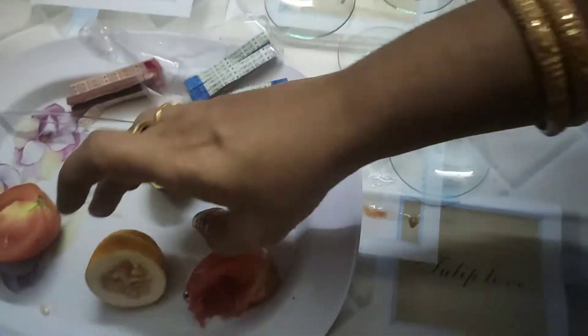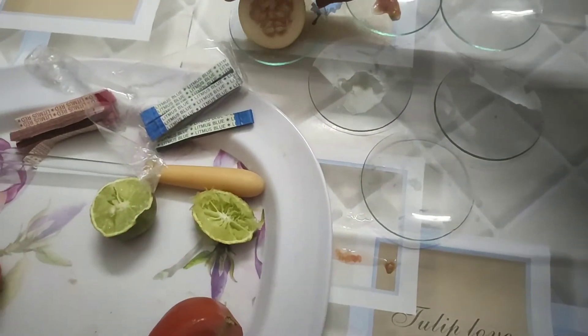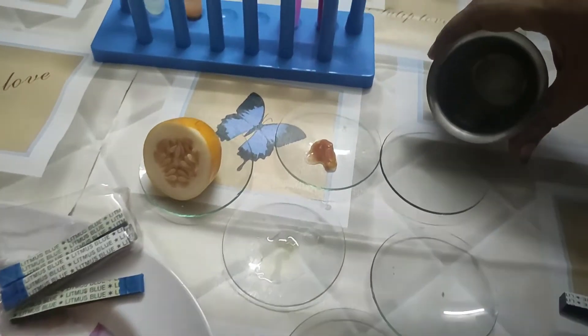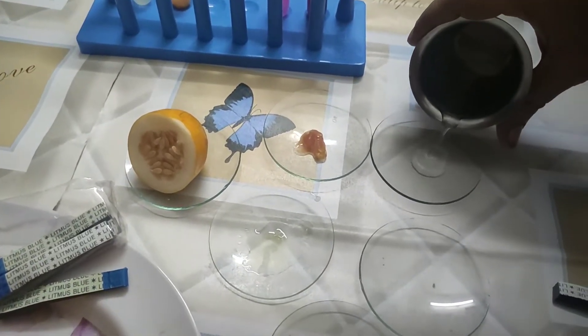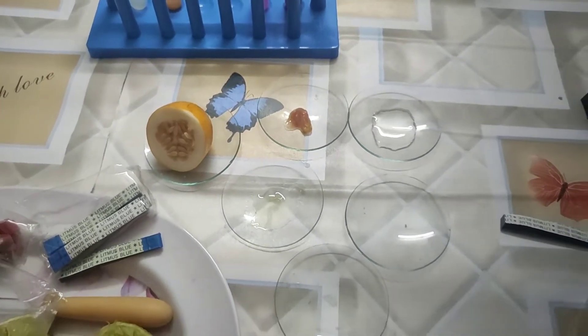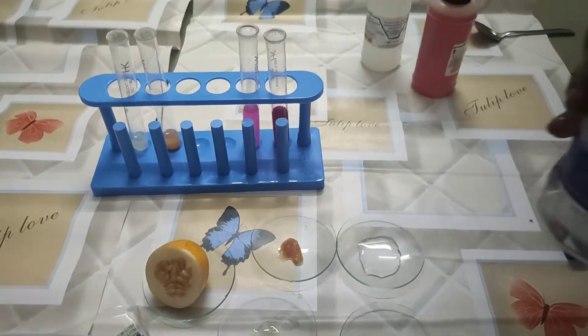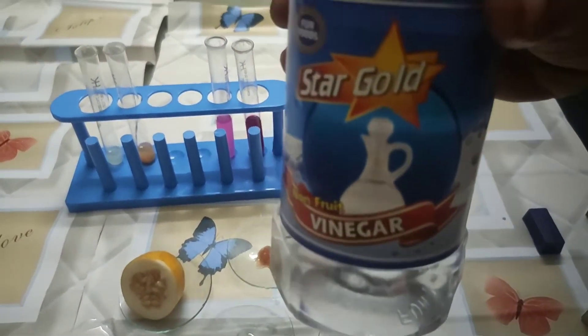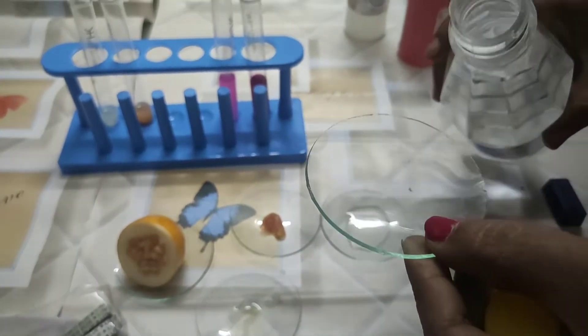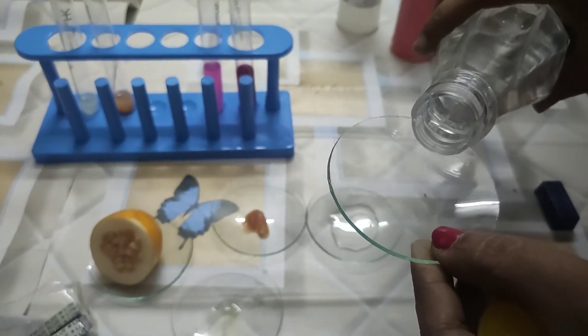A cucumber is taken there as well. Some water with baking soda mixed in — that is one sample. This is soap, and this is vinegar. Vinegar also contains acid, as we know, so I am also taking it in the watch glass.